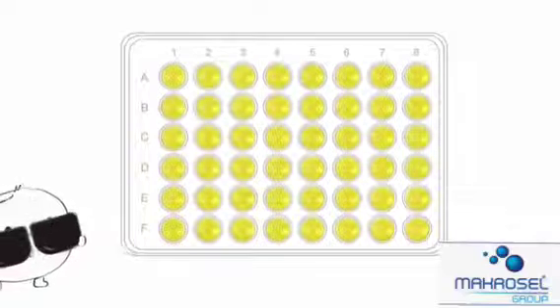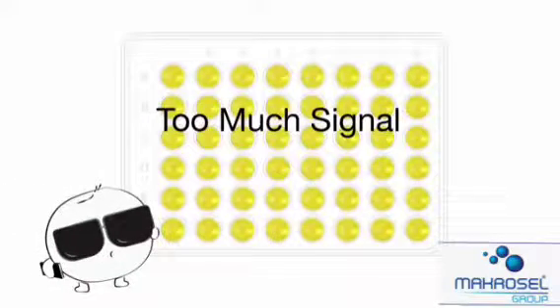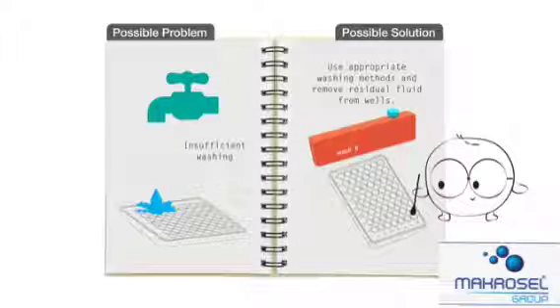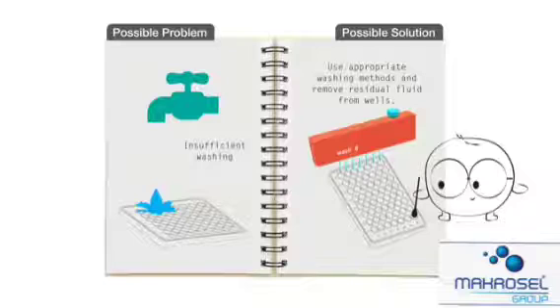Problems with too much signal can be caused by the following. Insufficient washing of the ELISA plate. In this case, please use appropriate washing methods and remove residual fluid from the wells.